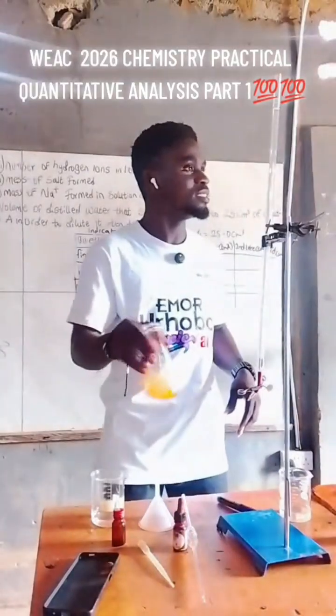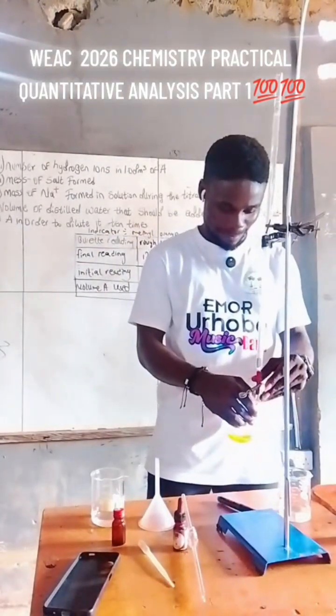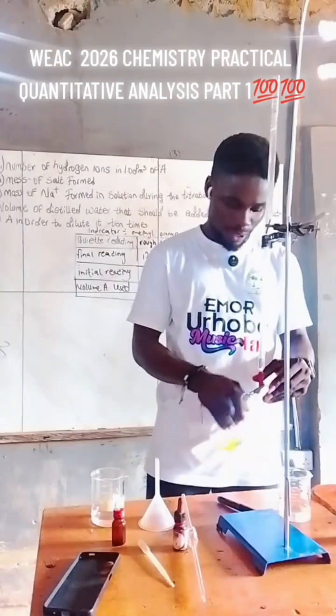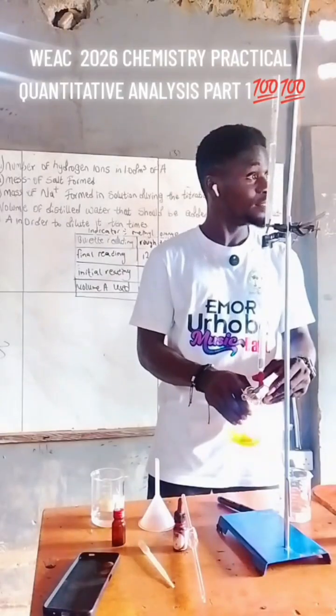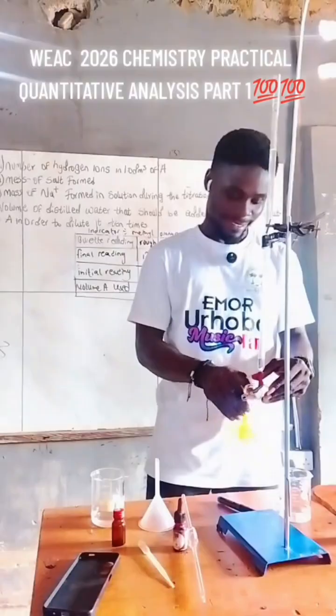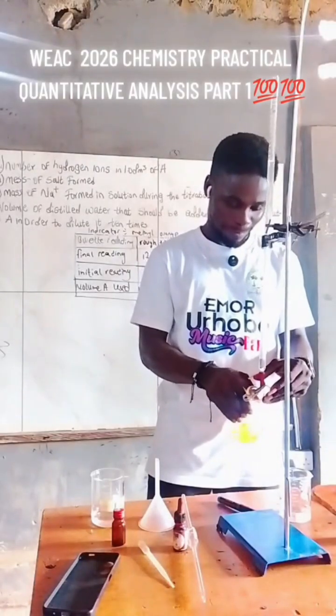Who is actually Munashi? Then it titrates again, until we get a what? A pink color, right? A pink coloration. A wine color. Munashi wine color. It's not wine color, it's pink. Oh. I don't know where you got wine from.